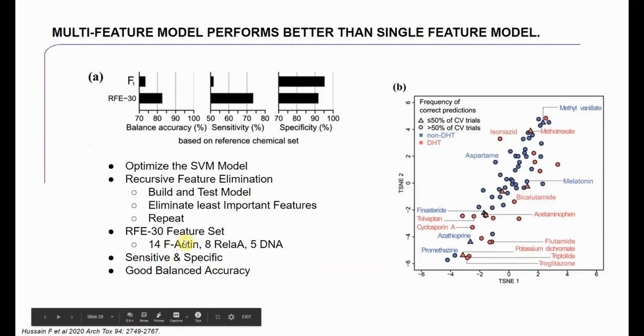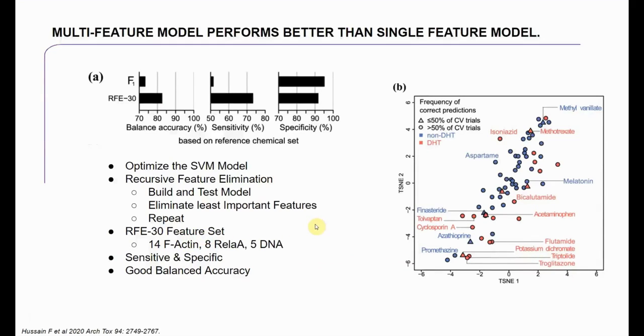And so this is a nice example of how you can really make use of the full power of high content analysis. You're calculating many features, some of which you may not really understand what their connection is with your biology, but by using machine learning, you can combine these features and come up with a feature set that actually gives you a very sensitive, specific, and accurate model.